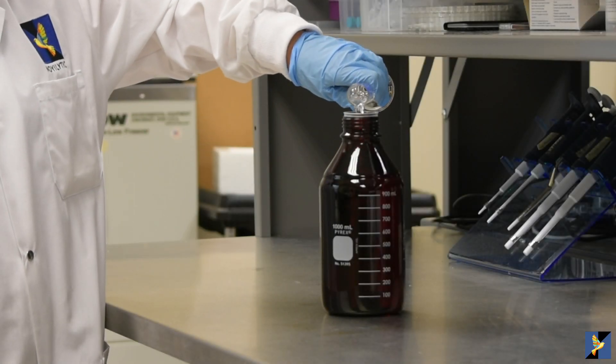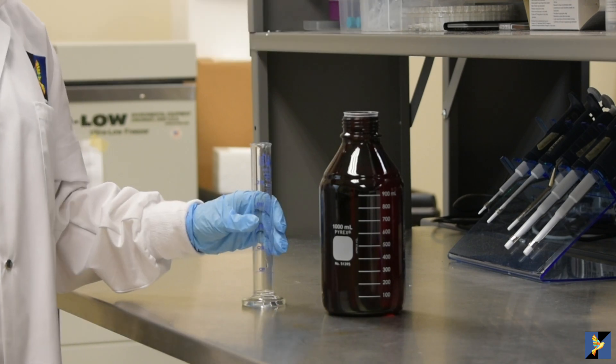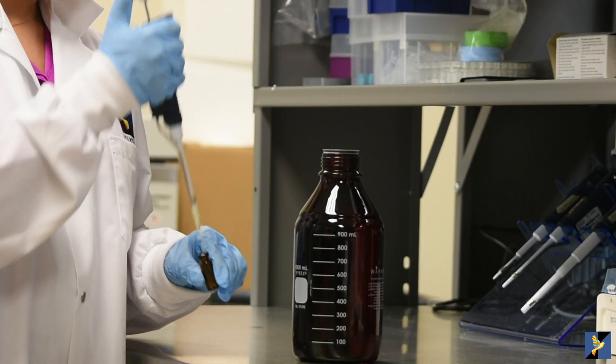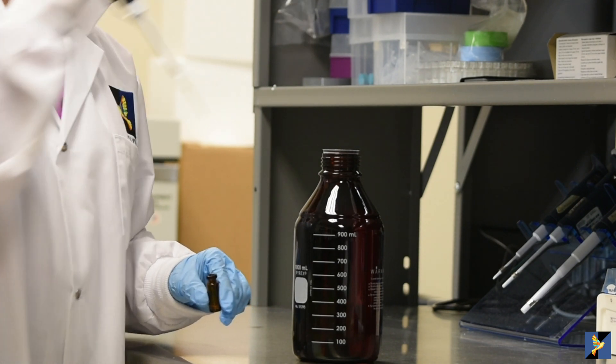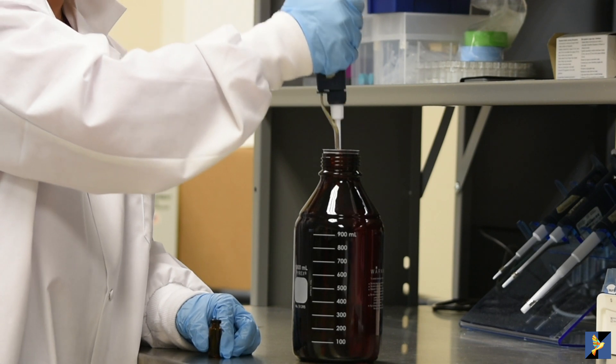Add 50 milliliters of acetonitrile to your mobile phase. Transfer the contents of the reagent vial to the bottle of mobile phase. Rinse out the contents of the vial to ensure quantitative transfer.